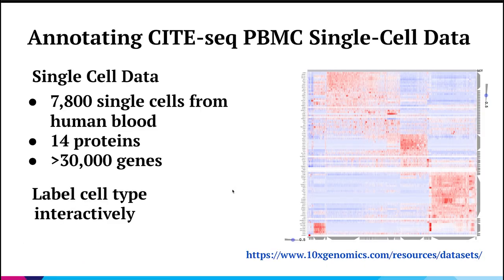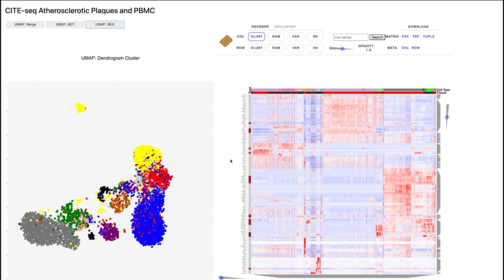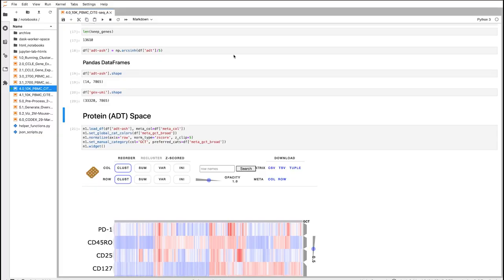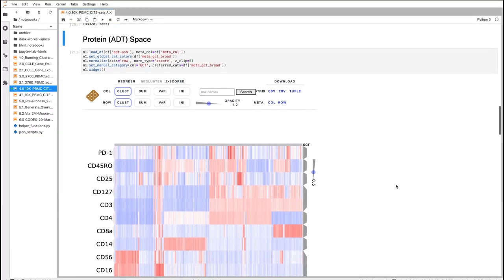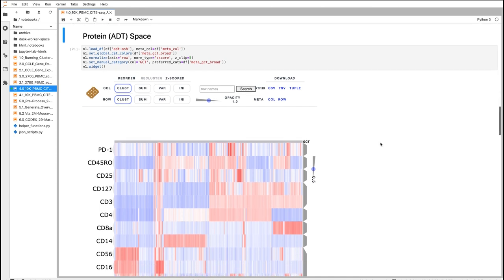The next example demonstrates how we can use ClusterGrammar to annotate some unlabeled data. In this dataset, it's a CITE-seq dataset where we're measuring 7,800 single cells — 14 proteins and over 30,000 genes. We're going to demonstrate how we can create two different linked views of the cells in those two different measurement spaces and go through and annotate those cells in an actual JupyterLab instance.